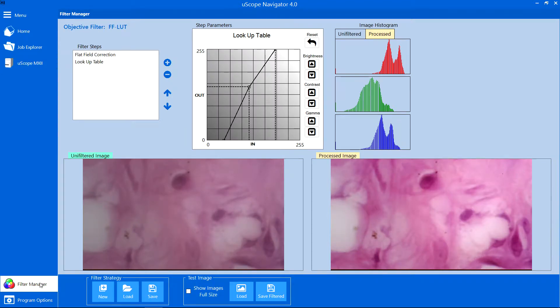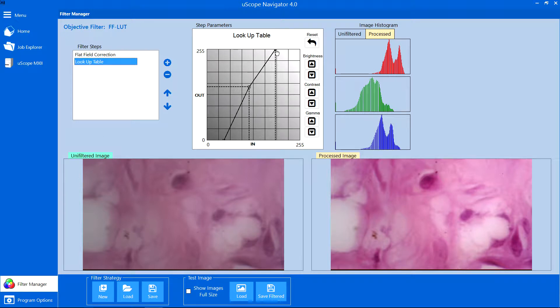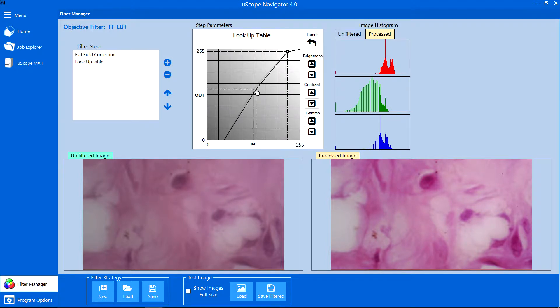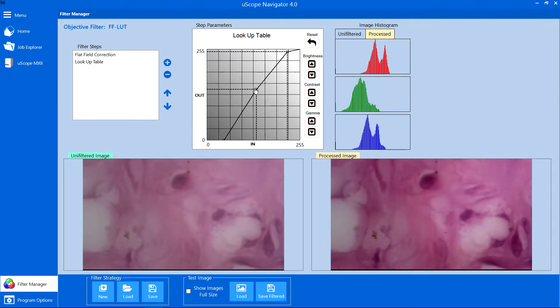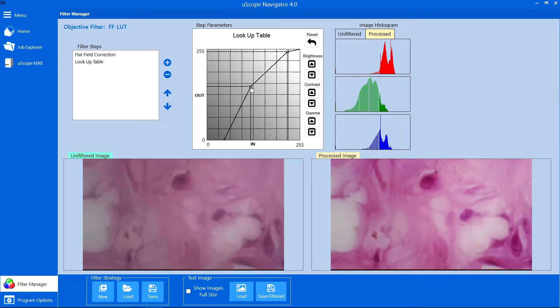The Filter Manager tab opens the filter editor, where you can create and modify filter sequences you apply to images from the overview or objective cameras. You can also create filters to apply to generated deep zoom images.